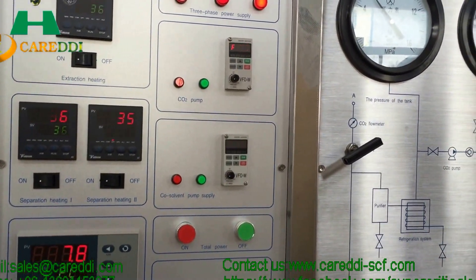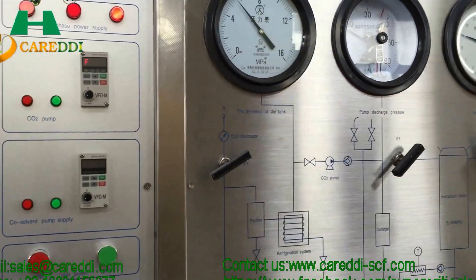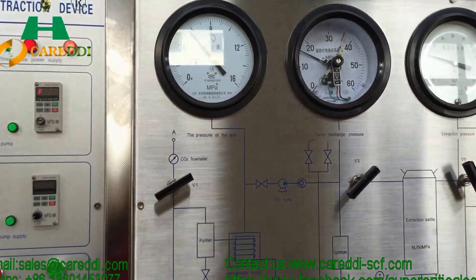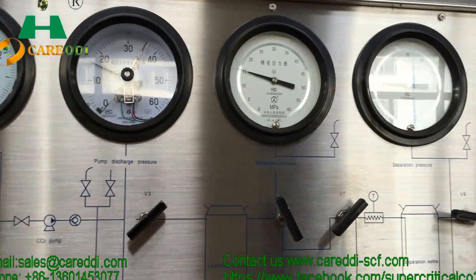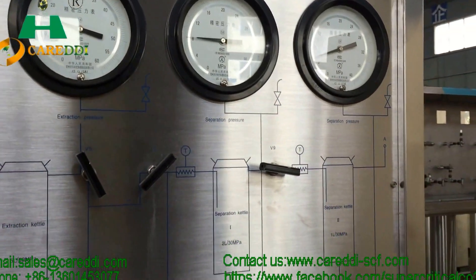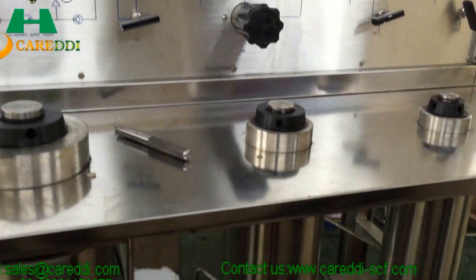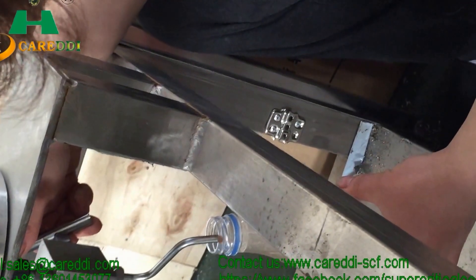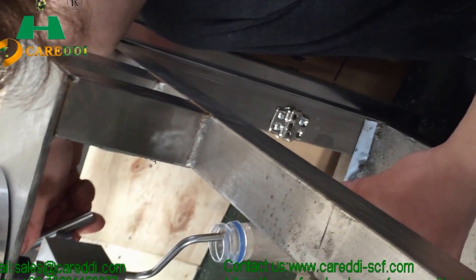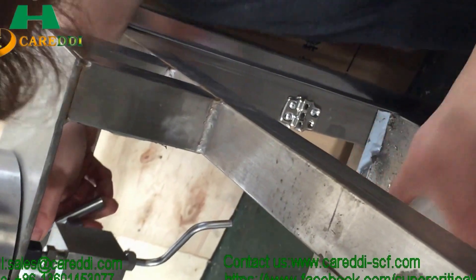The instruments now show the temperature and the pressure inside the tank. This is the water temperature. Now it is collecting the oil from the separation tank — this is oil. It is gold-colored oil, and that is how the water system works.